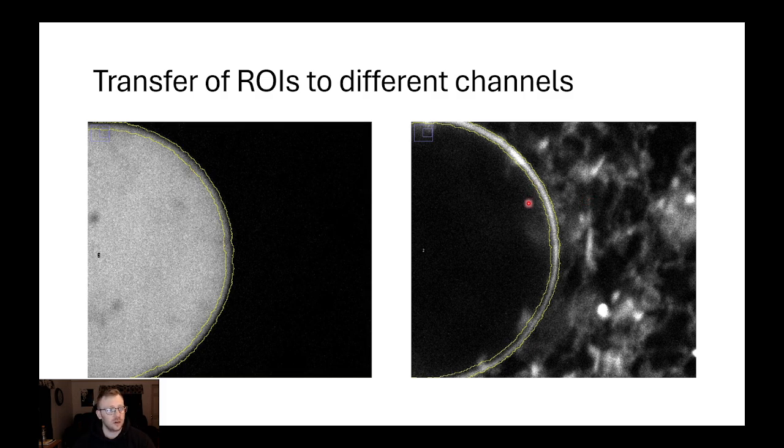And I talked earlier in my previous videos about the chemical dyes. This is an example of a chemical dye. It's just a dye that associates to lipid motifs. It's a lipophilic dye. So I'm labeling the entirety of the lipids along the nuclear envelope here, and then I can take the intensity value to know how much lipid is actually present at the nuclear envelope.